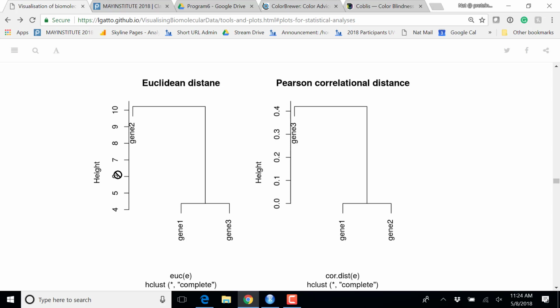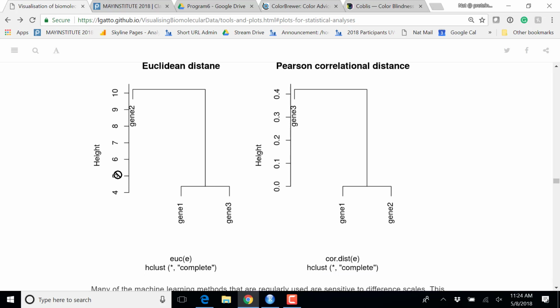So we need to be careful when we do clustering. What do we feed as input to this clustering? What kind of distances do we calculate? So one of the reasons why doing clustering is a difficult thing, because clustering requires some processing or some calculations, and these will have an impact on the final classification results.